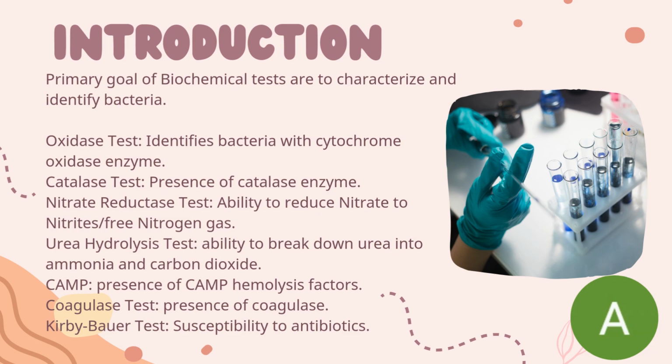To begin, the biochemical tests discussed in this report have the general purpose to characterize and identify a given bacterium. The oxidase test identifies bacteria with the cytochrome oxidase enzyme. The catalase test tests for the presence of the catalase enzyme. The nitrate reductase experiment tests an organism's ability to reduce nitrate to nitrite or free nitrogen gas.